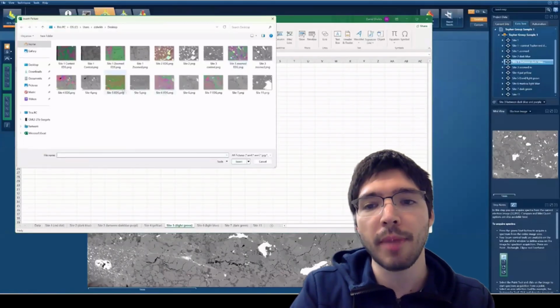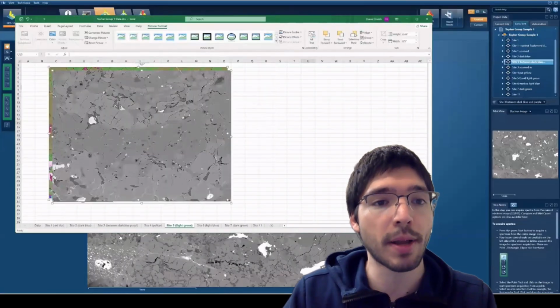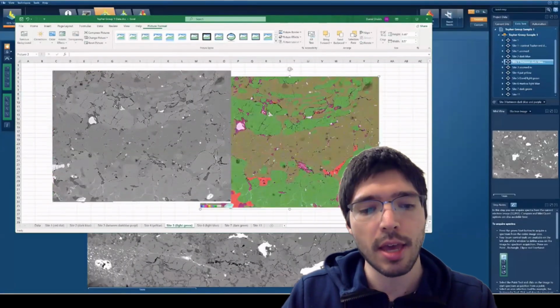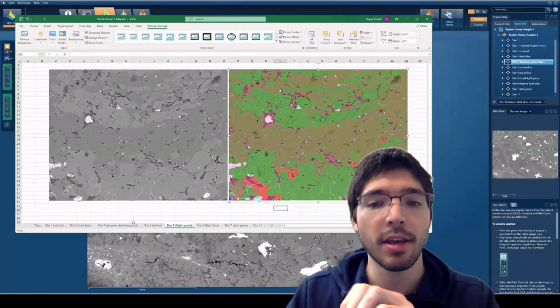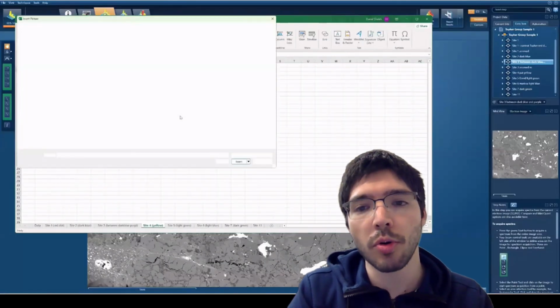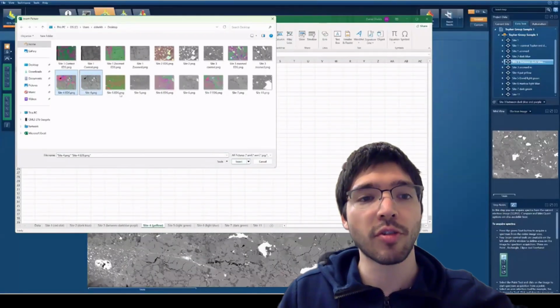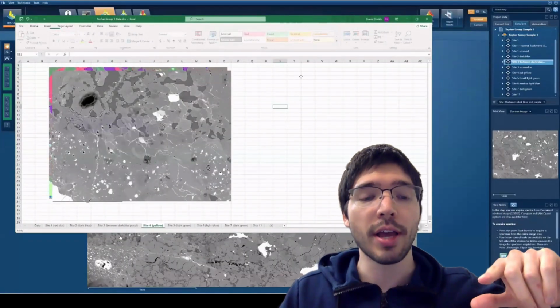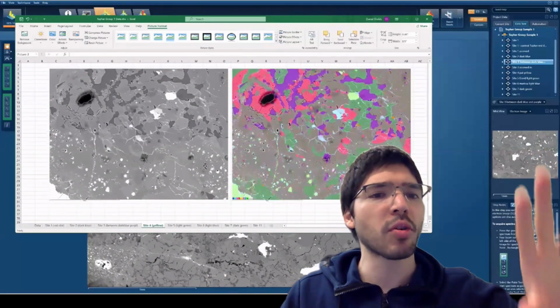Here, the main thing we focus on is whether we're getting a clean data spectrum from a mineral phase. Are the cation sums clean enough that we can fit this with a stoichiometric mineral? If we analyze 10 olivines and the totals vary from 92 to 94, but they're all clean olivines, I'm not so worried about that.